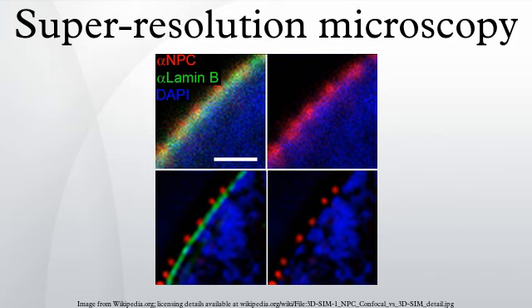Basically, the ANSOM tip is like a lightning rod, which creates a hot spot of light. Bowtie nanoantennas have been used to greatly and reproducibly enhance the electric field in the nanometer gap between the tip's two gold triangles. Again, the point is to enhance a very small region of a diffraction-limited spot, thus improving the mismatch between light and nanoscale objects and breaking the diffraction barrier.